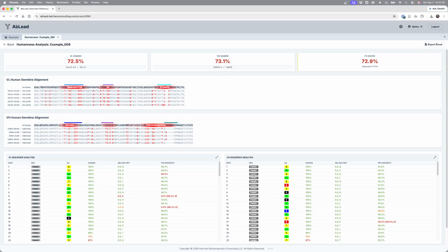You can look across here and see that indeed here's a set of 9-mer peptide overlays that do not appear to be human. The colored regions are the depiction of the default CDR boundaries, in this case, North boundaries. If I mouse over, you can see where the 9-mer peptide lies, and how many mutations it would take for each peptide to reach human.